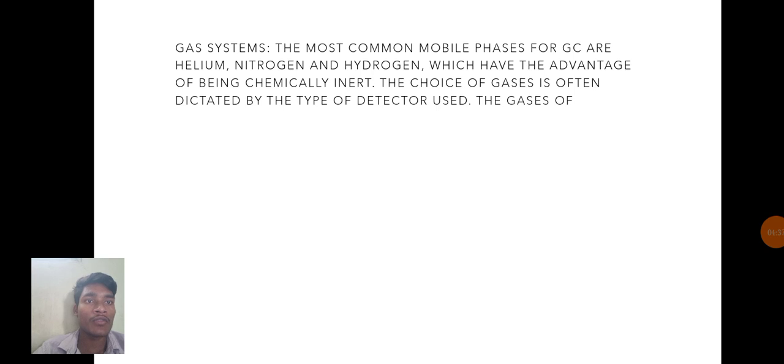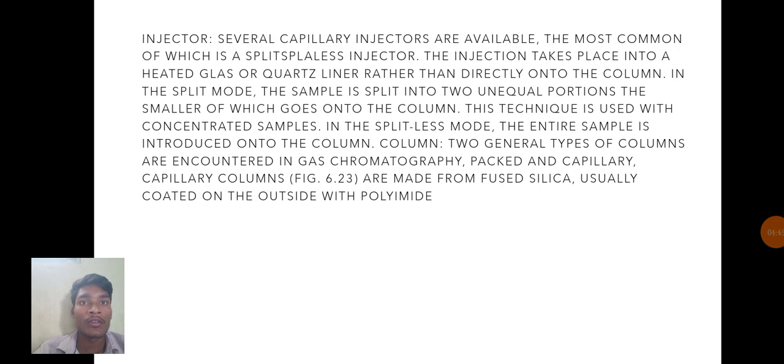The choice of gases is often dictated by the type of detector used. Next, injectors. Several capillary injectors are available, the most common of which is a split/splitless injector.